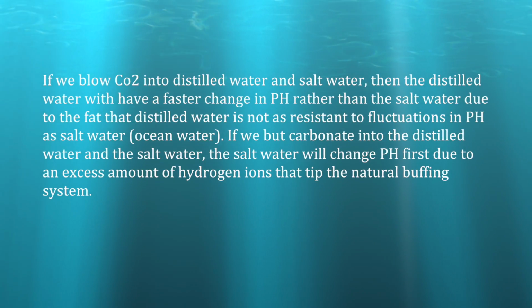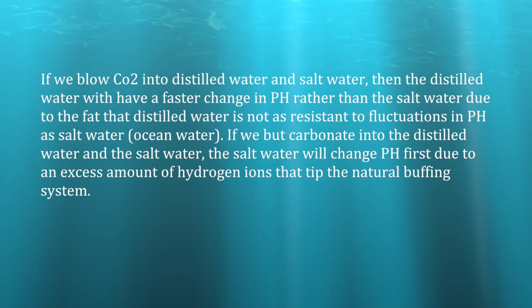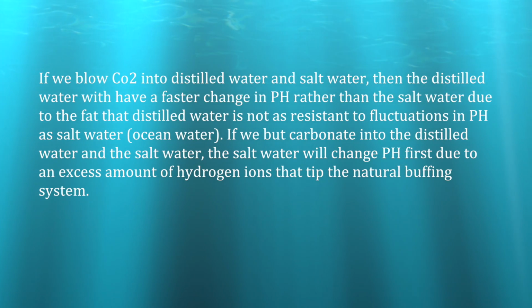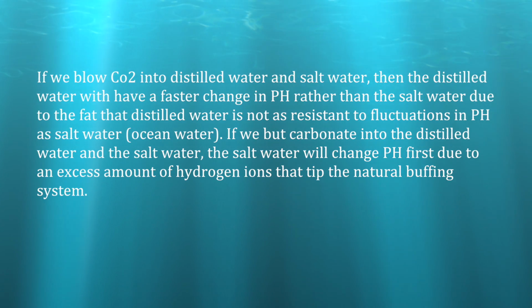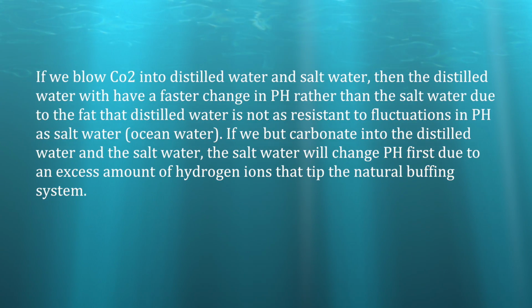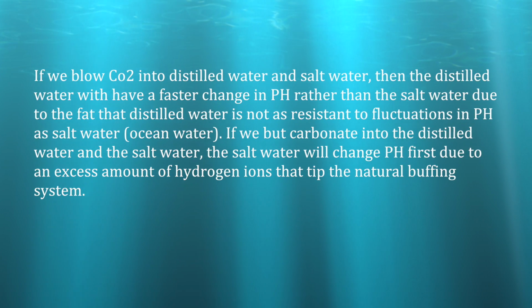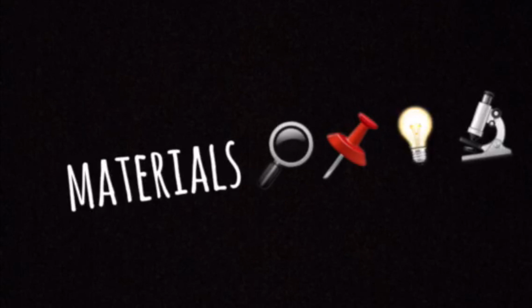If we blow into distilled and salt water, then the distilled water will change colors first rather than the salt water, since fresh water is not as resistant to changes in pH. In this case, that's adding CO2 to the waters by blowing into them. If we put carbonate into distilled and salt water, then the salt water will change colors faster due to an excess amount of hydrogen ions that tip the buffering system.